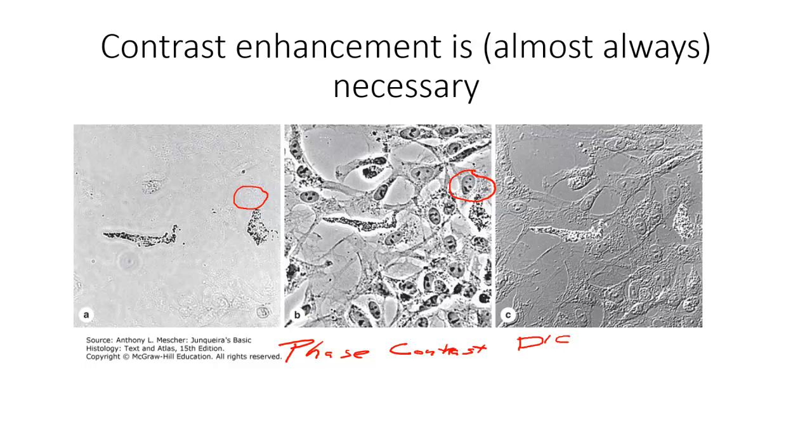In this case, we're going to shear it using some polarizers. We're going to pass that light through a couple of prisms, and we're going to repolarize it as it comes back out. And essentially what that's going to do is give us this kind of three-dimensional appearance where small differences in density are once again rendered out as differences in contrast.